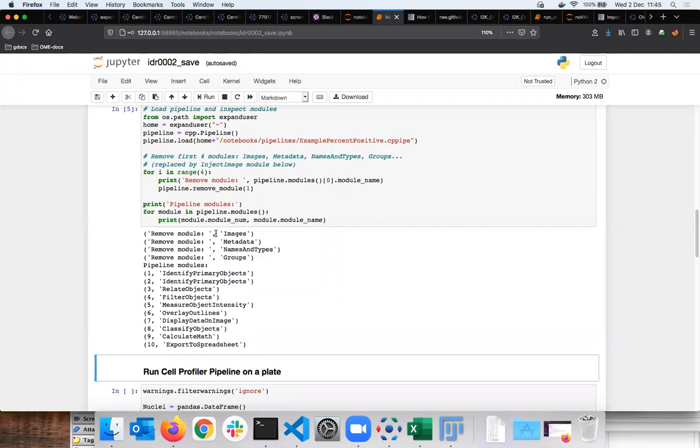Have some of you used CellProfiler before? People are still alive. Okay. So you can do quite a lot of segmentation and image classification, etc. But I think the gist is to give you, so that's a tool written in Python.